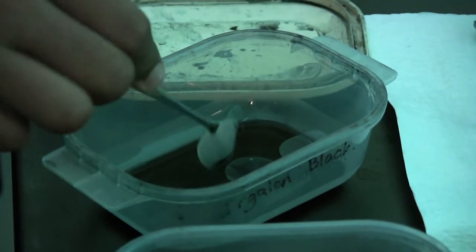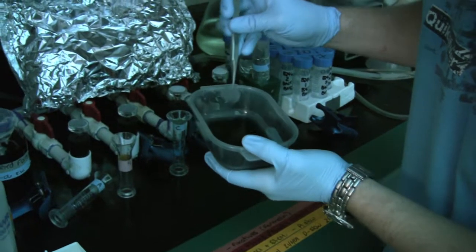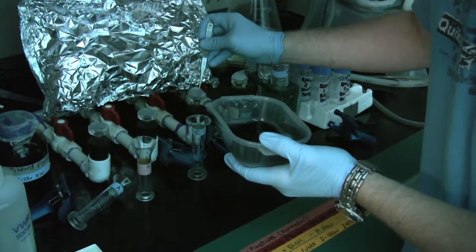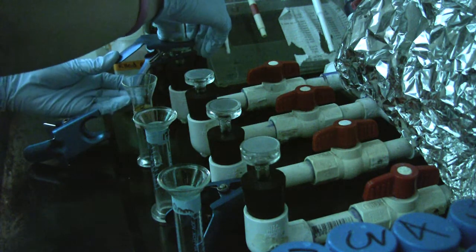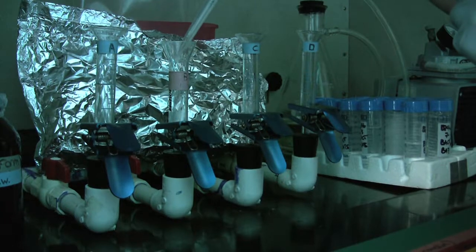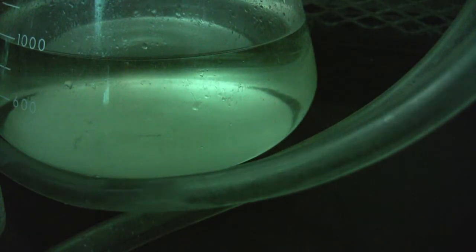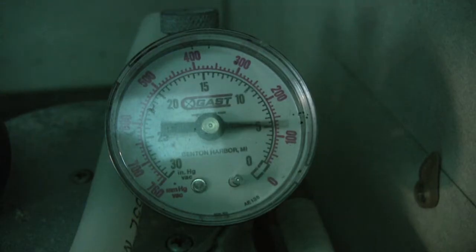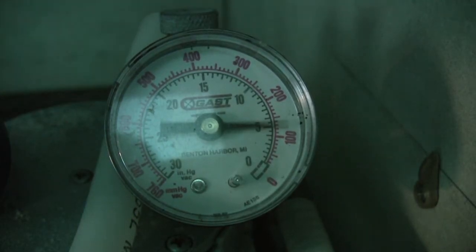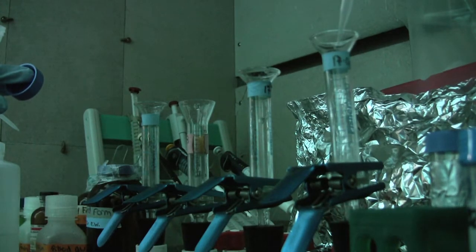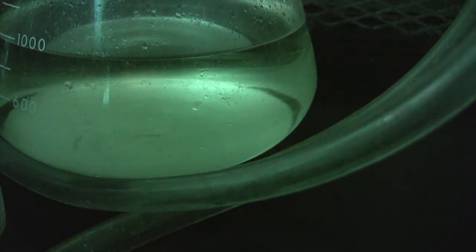First, we inverted the test tubes to mix the bacteria, then we dyed the filters so the DNA would show up. We put three milliliters of water into test tubes and suctioned it out so that just the bacteria was left. Then we added DAPI and drained that out too, so all the bacteria turned blue.